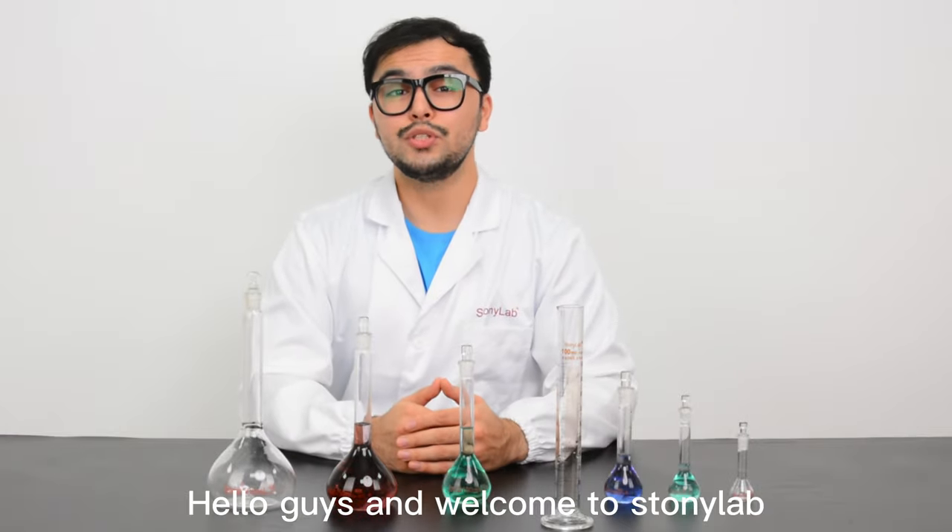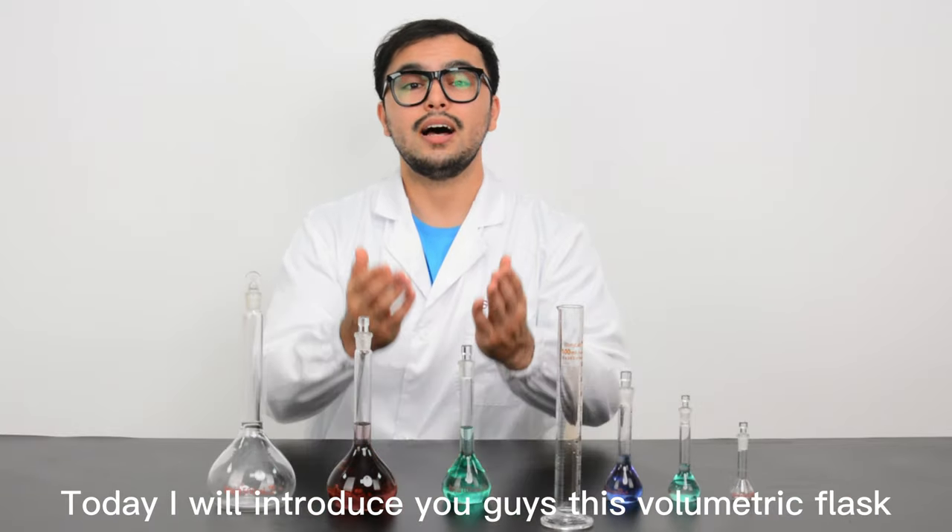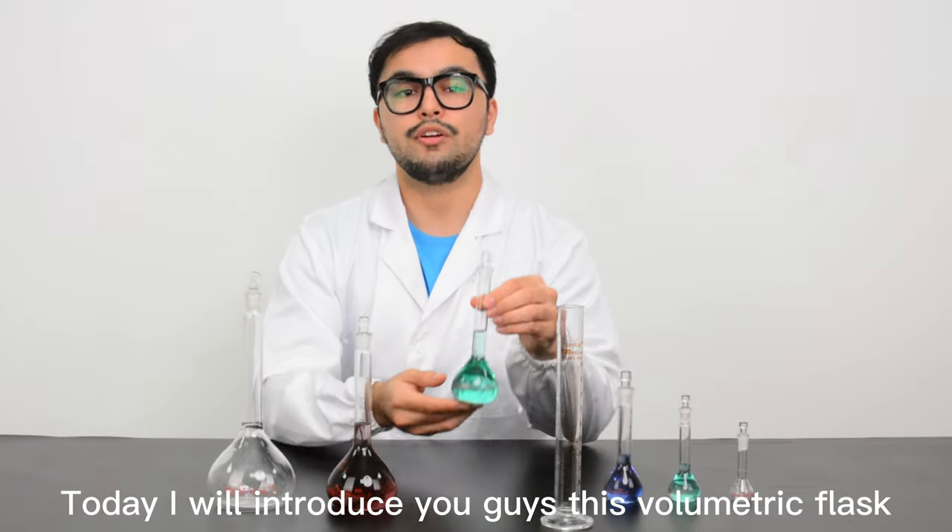Hello guys and welcome to StonyLab. Today I will introduce you guys this volumetric flask.